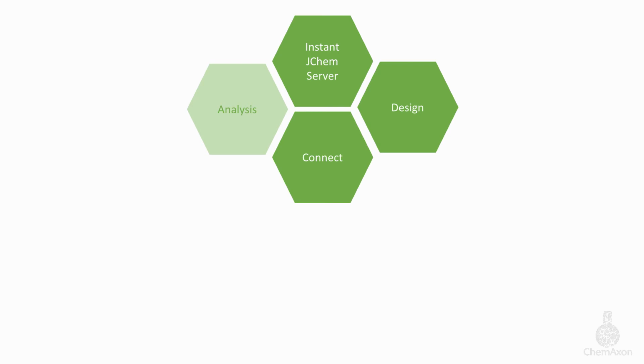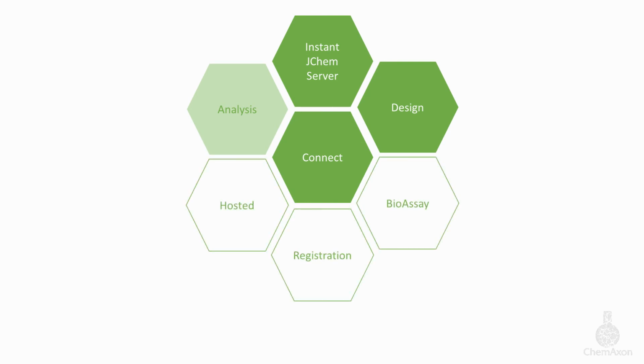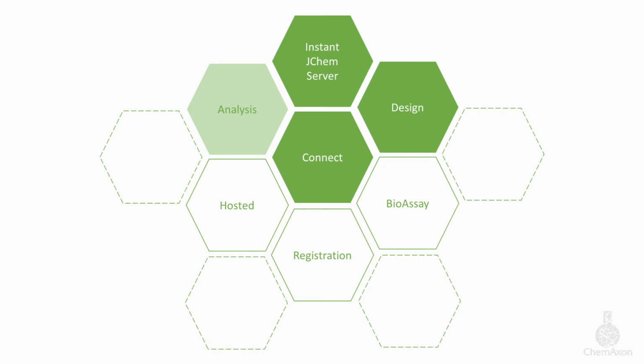We just started the development of a new data visualization and data analysis module featuring dynamic scatter plots, histograms, and other chart types, SAR and R-group analysis functions. It's called Analysis. Further modules for chemical compound registration, macromolecule registration, and for the management of biological data, assays are planned, and we also plan delivering Plexus functionalities in the form of hosted services as well. The Plexus Suite will be extended by additional modules in the future, tailored to specific scientific and research management workflows.